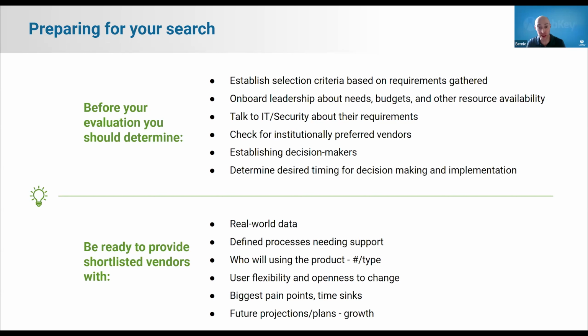Or you may discover that your institution has a set of preferred vendors, which is probably where you should start your search. And likely related to that institutional leadership, you should determine who and how a decision will be made and disseminated to everyone else, as well as when you're trying to make those decisions.